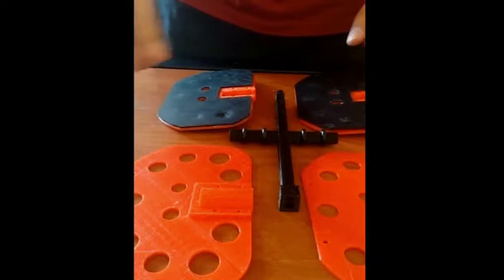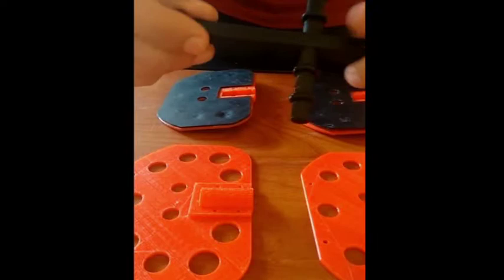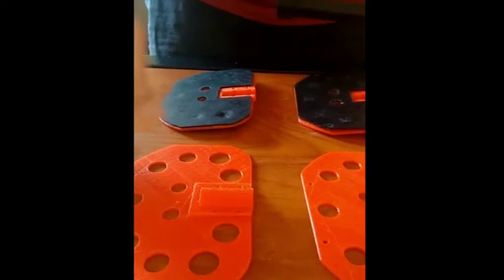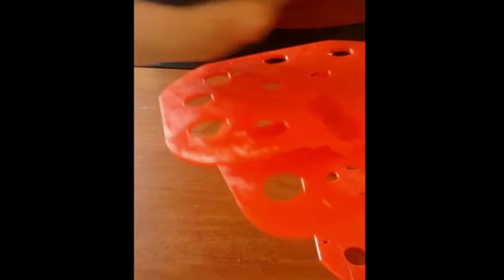Now we will try to assemble the test tube holder or the rotisserie sub-assembly on the shaft that we printed out. This is the shaft with O-rings attached on them as you would have seen. The rotisseries have slots that can accept the O-rings, and what we do is sandwich the rubber pad between two sets of rotisseries.